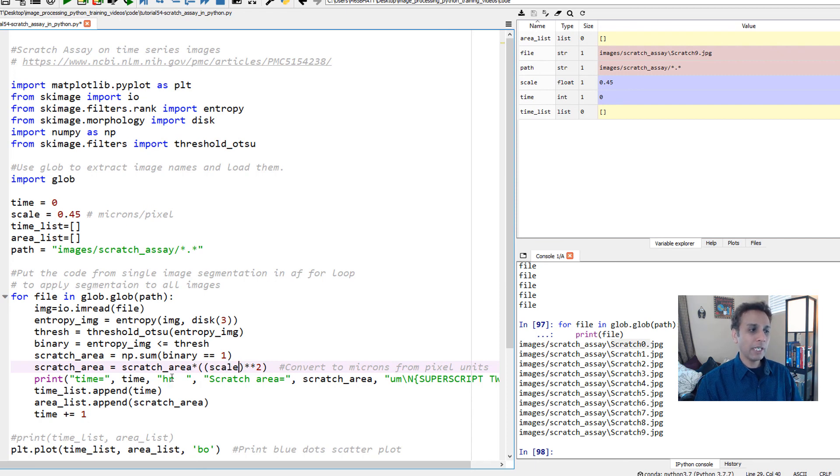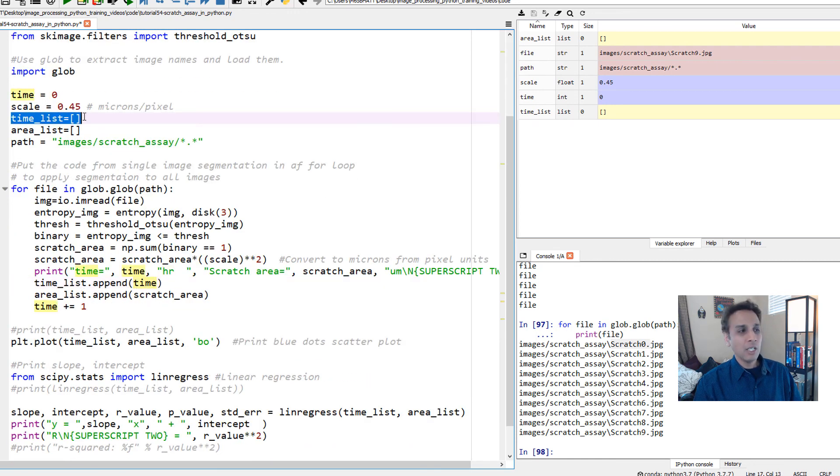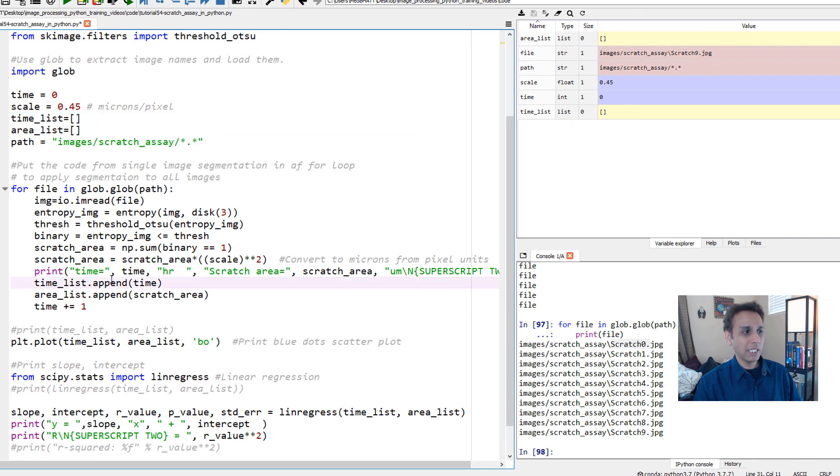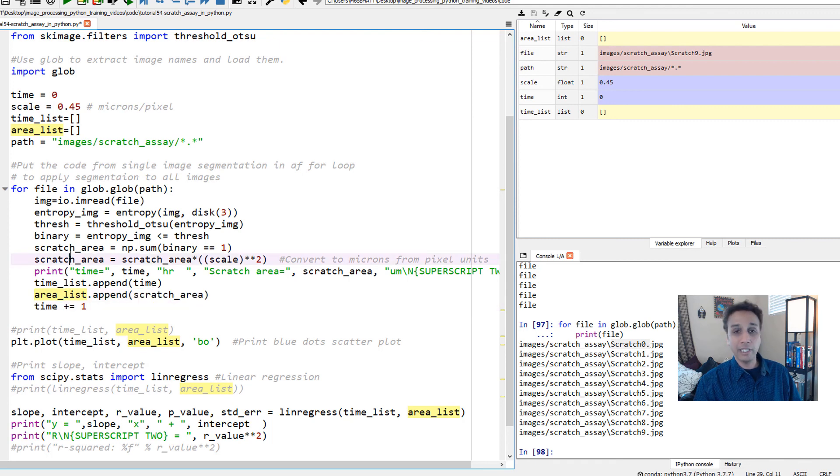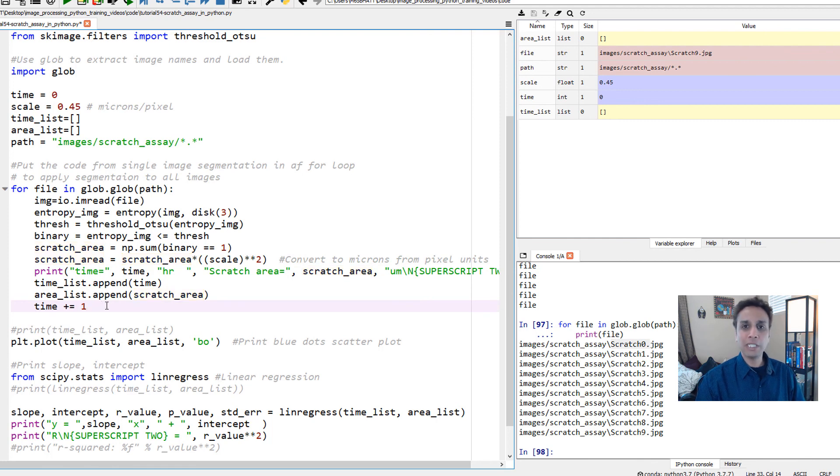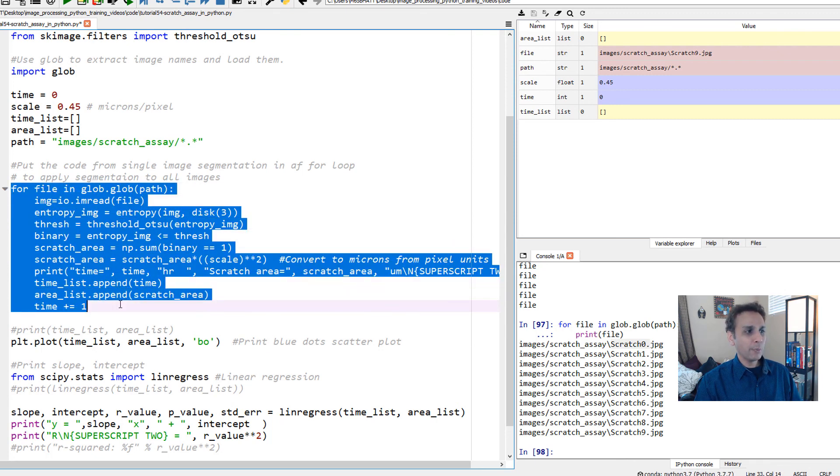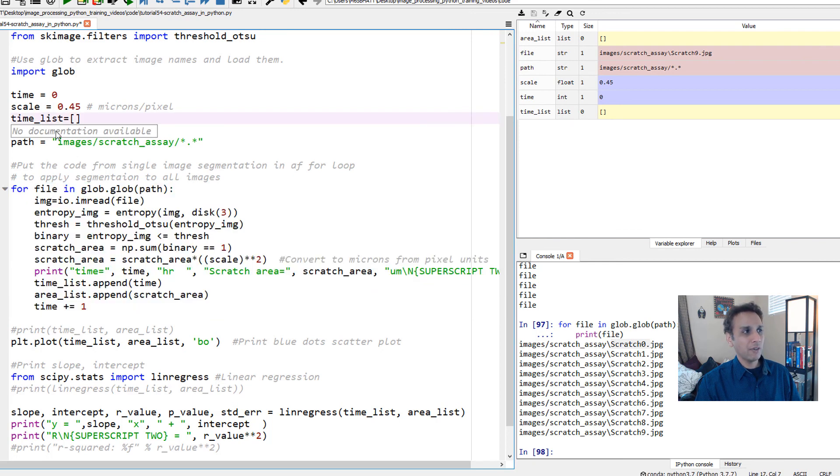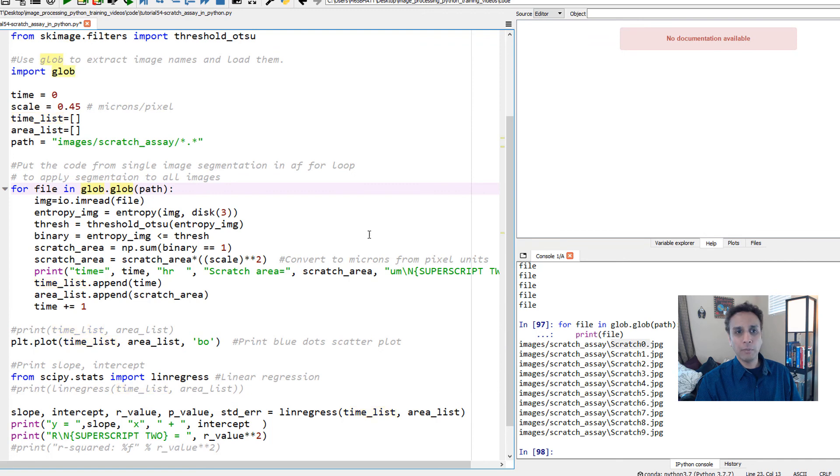I'm converting my scratch area from pixel square to micron square by multiplying by the scaling factor, printing it out and appending this to the list. To the time list, append time and move on to the next one. To the area list, append the scratch area that we're calculating. At the end of this increase the time by one. If your time is 10 minutes change this to 10 minutes. After this for loop is done we should have a list for time and a list for area that we can plot.